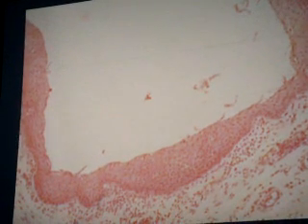And you should see glands in the lamina propria and in the submucosa if you want to differentiate it from the vagina. Ang vagina nyo, ganyan ang lining epithelium, but the underlying connective tissue is dense, irregular connective tissue. Okay? And your vagina has no glands in the underlying connective tissue and it's highly vascular.